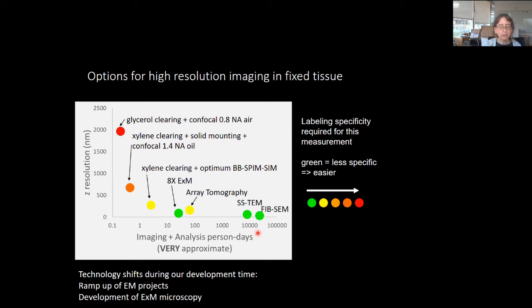And this data tells you about stereotyped synaptic partners in the fly brain. And so one of the questions that we were trying to address with this microscope was, if I have identified a neuron that I think is involved in a behavior and I want to know who its partners are, how do I find that out?